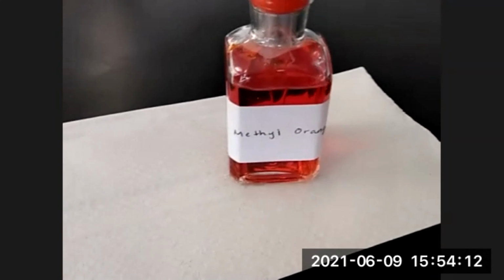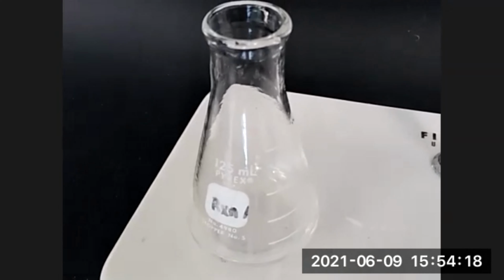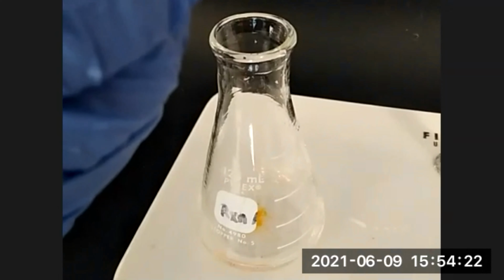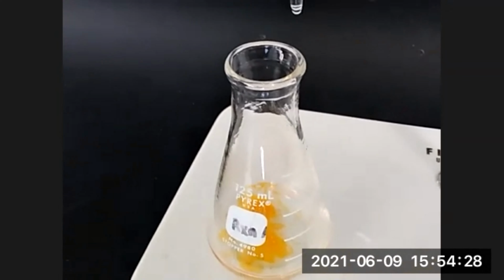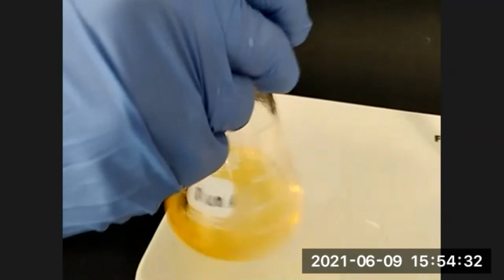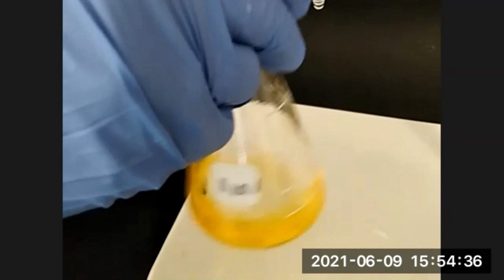So now it's dissolved. We're going to add the methyl orange indicator. Just a couple of drops is all that is needed. So you see here, we only added 3 drops. The initial color of the solution is like a yellow orange. I would say more orange color solution.